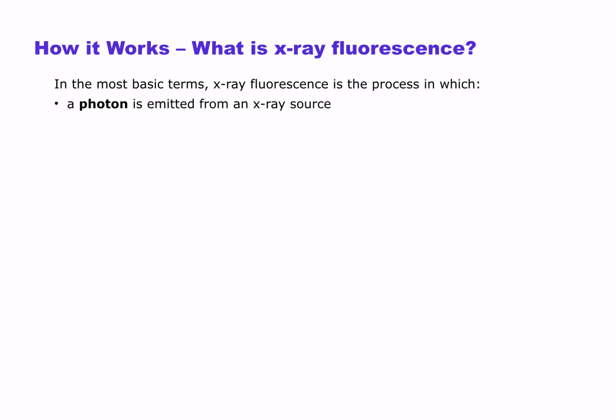This excites photons and produces a bell curve that, instead of stretching from 1 to 3 electron volts, stretches from 1,000 to 40,000 electron volts. And these are the energies at which atoms fluoresce. And this interaction with atoms is the key difference between color fluorescence and X-ray fluorescence. With color fluorescence, you're interacting with the outer electron shells of molecules. With X-ray fluorescence, you're analyzing the fluorescence of internal electron orbits. As a consequence, we get atomic information, not molecular information.